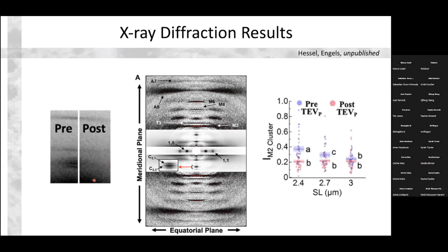And so this is just showing the reduced data for the intensity of the M2 cluster here, which has been associated with myosin binding protein C, but it's a bit controversial whether C protein actually directly contributes to these reflections or not. And so I'm gonna leave it at that, although we're really super excited because the technique that we're using actually should allow us to add back even more C protein for technical reasons. And so I'm looking forward to testing the idea that these reflections are due to C protein itself.